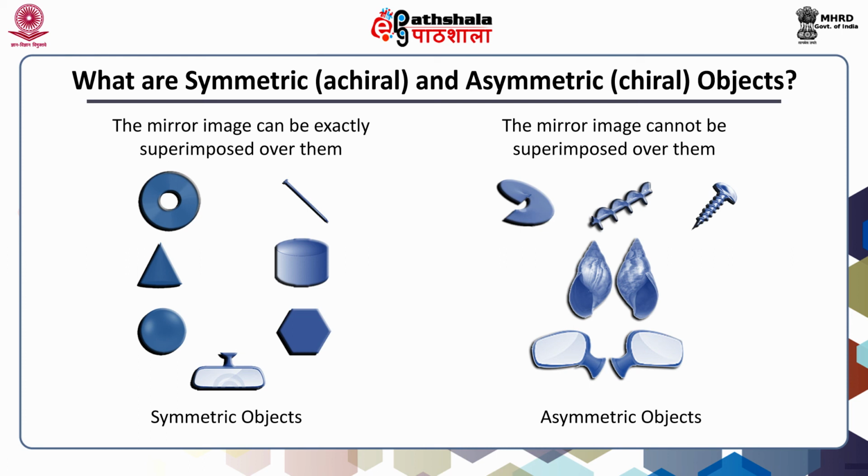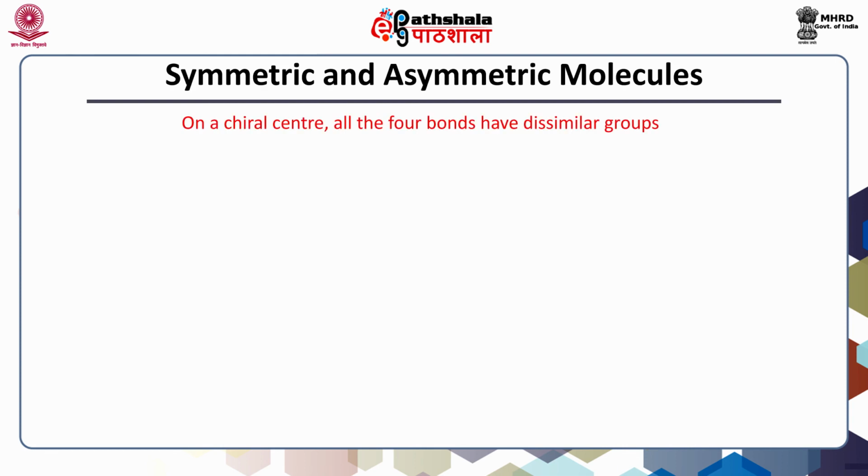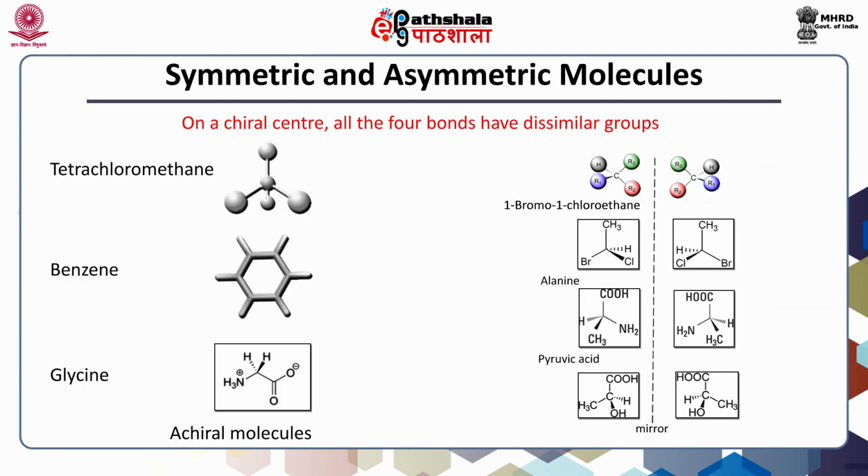These are regular structures. The alpha carbon in glycine is bonded with carboxylic, amine and two hydrogens and thus is not a chiral center, while in all other amino acids, where one of the hydrogens on the alpha carbon is replaced by a carbon side chain, it is a chiral center. On the other side, we see some examples of asymmetric molecules with a chiral center.